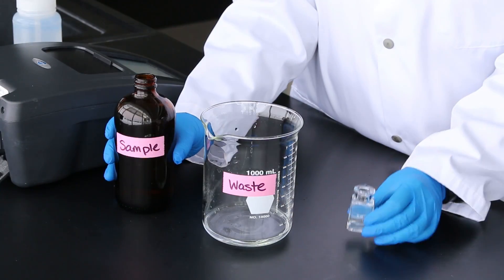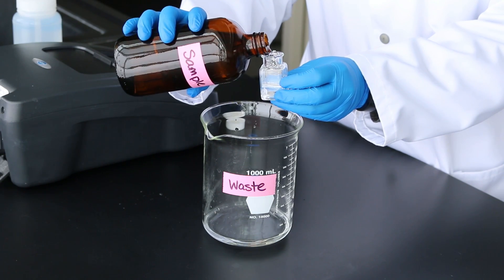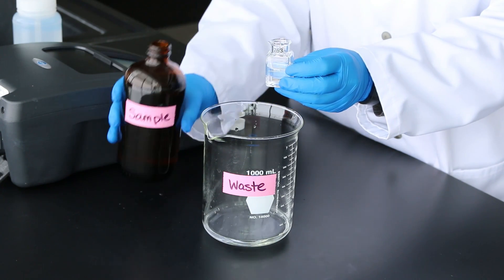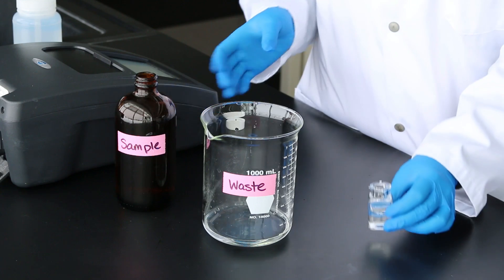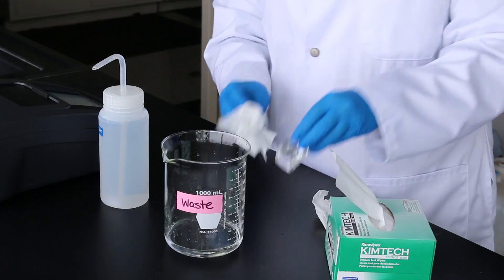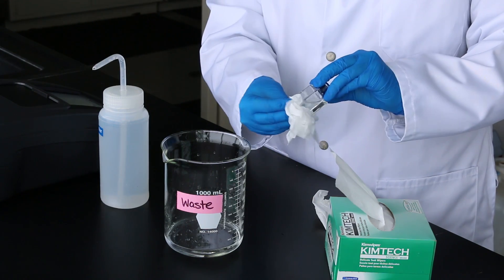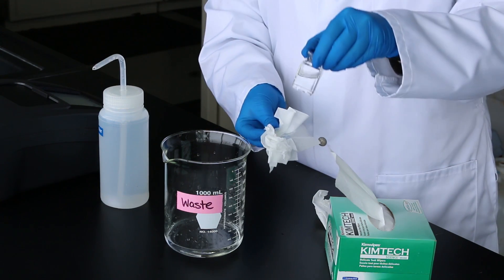To prepare the blank, rinse and fill the appropriate sample cell to the level indicated with the sample water. Ensure the outside of the cell is fully cleaned and dried to not interfere with your measurement. If the sample cell is significantly scratched, a new cell should be used as this will interfere with your readings.